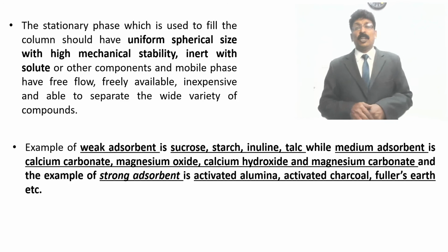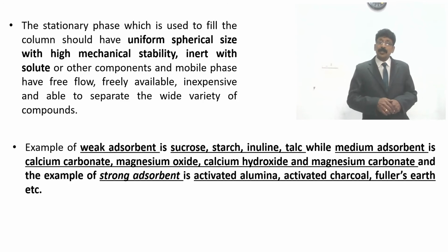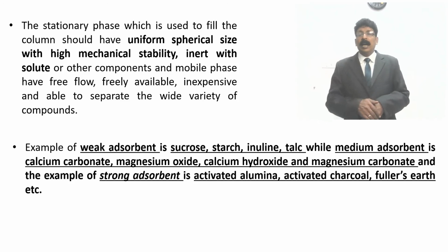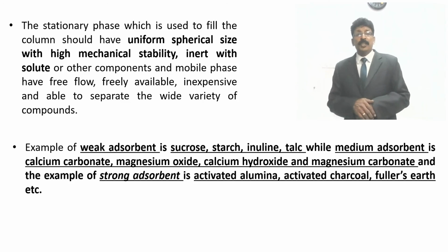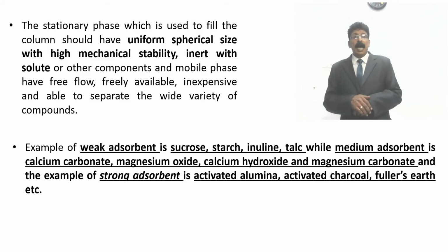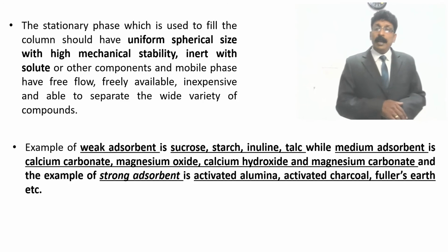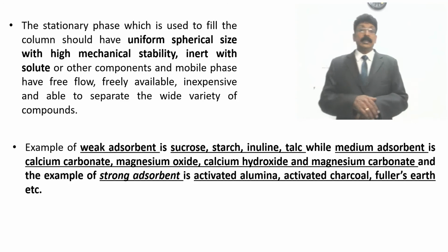For example, weak adsorbents are sucrose, starch, inulin and talc, while medium adsorbents are calcium carbonate, magnesium oxide, calcium hydroxide and magnesium carbonate. Examples of strong adsorbents are activated alumina, activated charcoal, fuller's earth, etc.